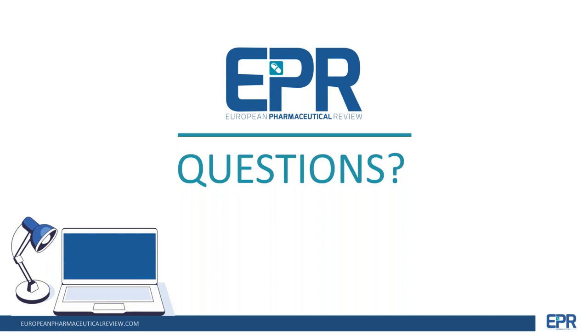Okay, another question. What kind of data processing software can you use for analyzing ZipChip data? So the data that is generated on the mass spec vendor platform is also stored using the existing software from the vendors. There is no special software required for data processing that is ZipChip specific. So you can use the existing software. ZipChip has its own method acquisition or data acquisition software just for the separation part. But for data processing, you can use the vendor software and also some other third-party software, such as Protein Metrics.